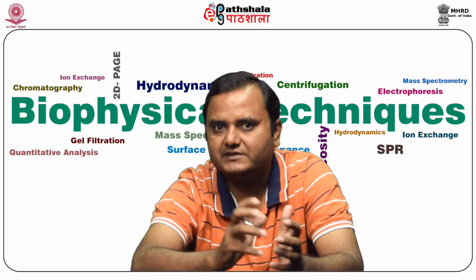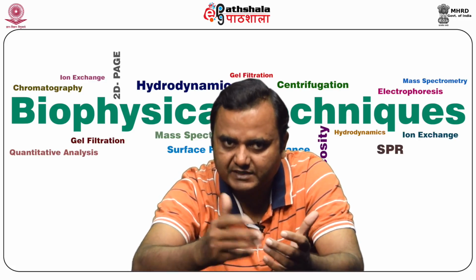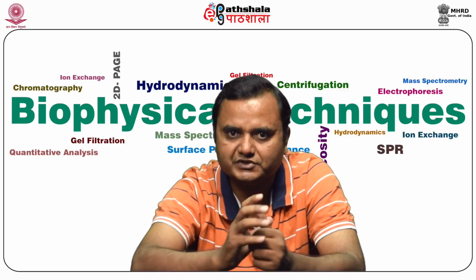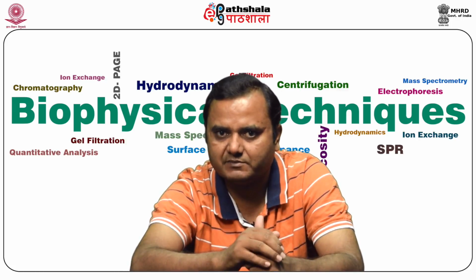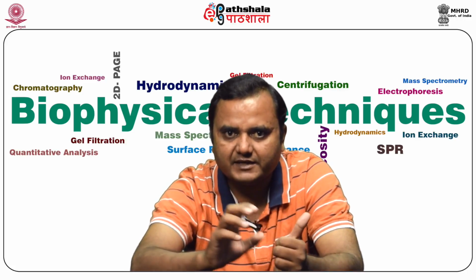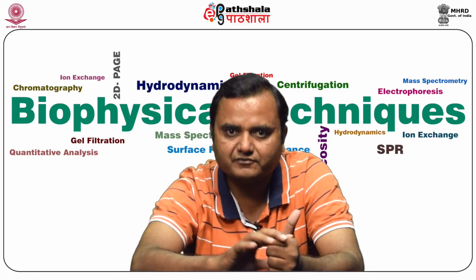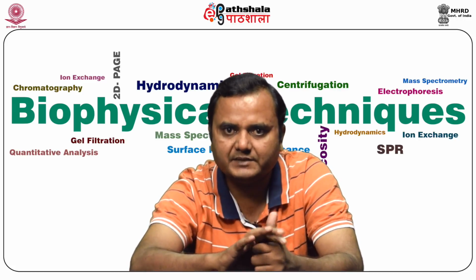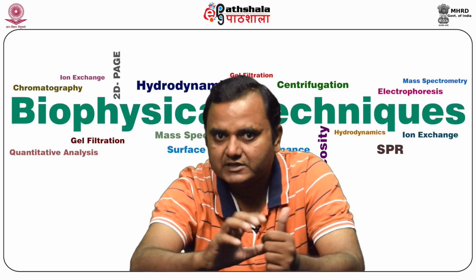The separation of these molecules depends upon the sedimentation coefficient of the particle, which is given in Svedberg units. The forces applied to the molecule are the gravitational force, and the centrifugal force depends upon the speed, time and the radius of the rotor.